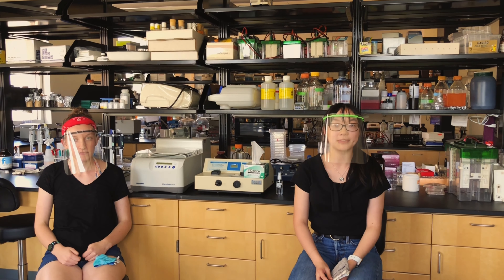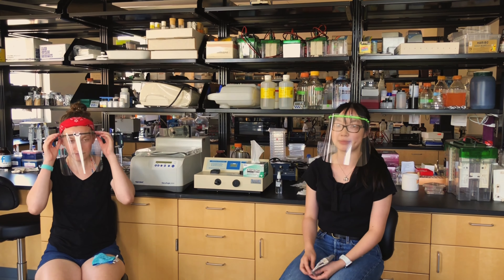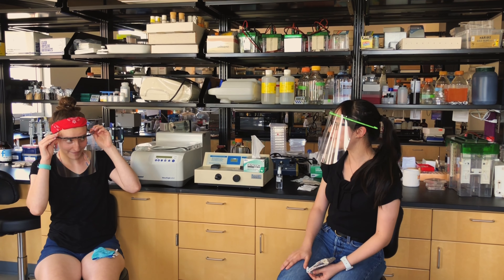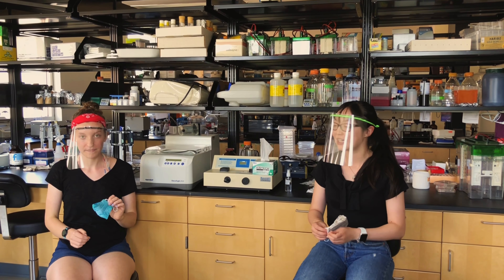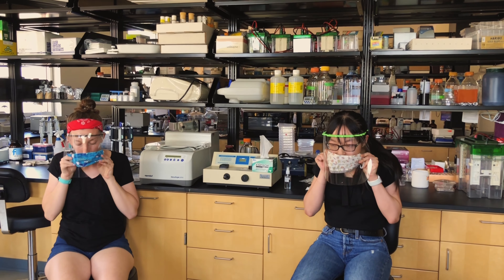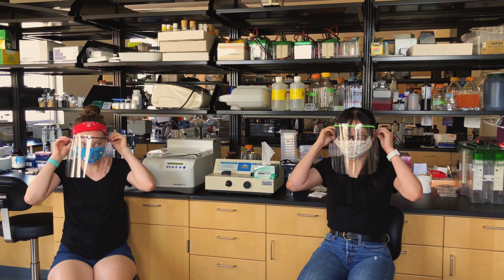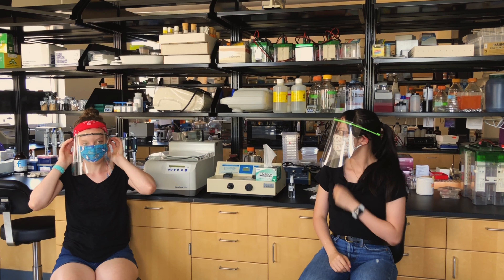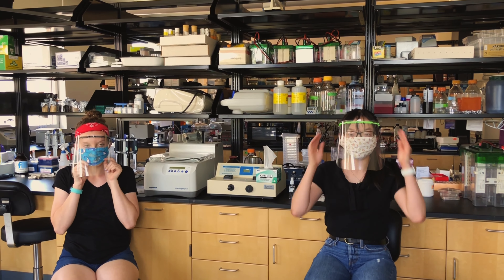Before you leave the lab, you want to switch out your face shield for your mask. Before you take off your face shield, you want to first put on your mask. Put on your mask from the ear loops. And once you have your mask on, you can take off your shield.